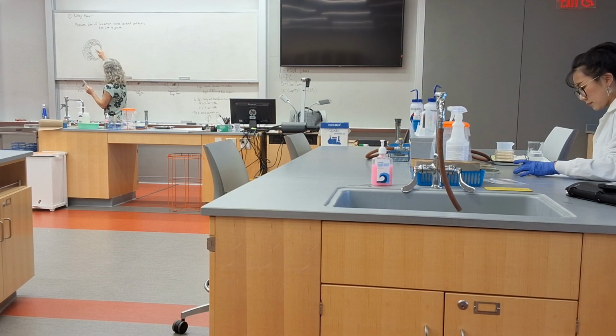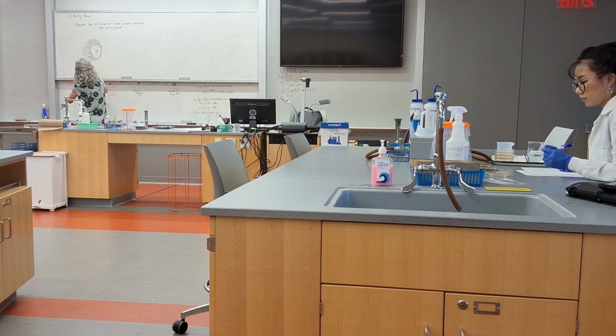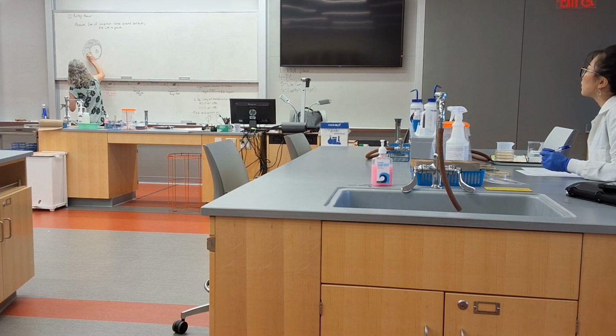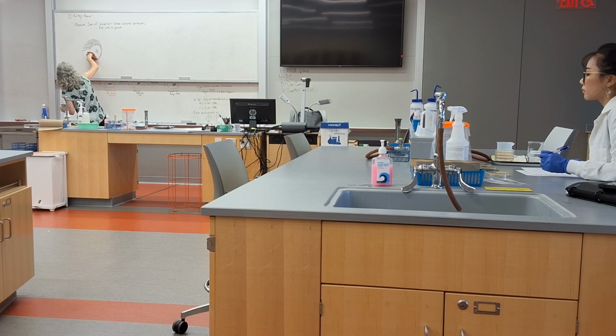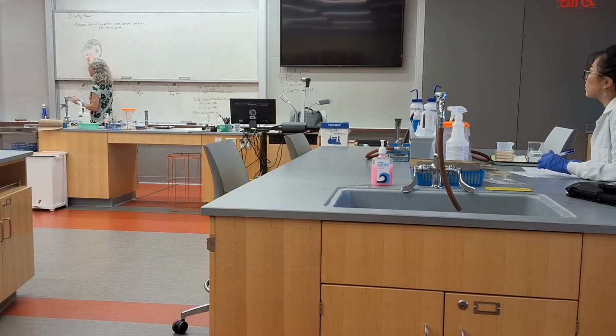Sometimes the discs end up like over here. And so when you have this zone, the circle is kind of cut off, or maybe even the zones of inhibition are colliding with the one next to it, and it's really hard to find this distance. You have 2 options.